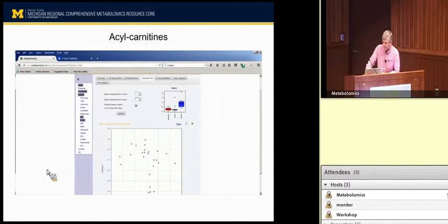There's actually a number of different acylcarnitines. Look, it's like I can't see there and I can't see here. It's like I can't see anything. This was, I forget exactly what this one was, but this is the principal component for the PLSDA. So these are the loading scores.